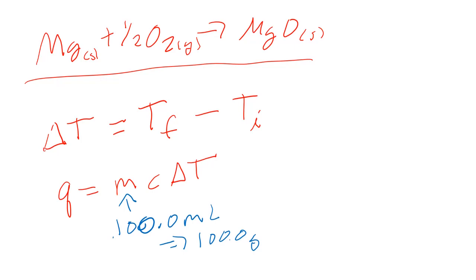C is the specific heat. Since the hydrochloric acid is diluted with water, we can just use the specific heat of water as an approximation, and it's a pretty good approximation given how much of your solution is water. The hydrochloric acid will still not feel very good on your skin if you get it on there, which is why you need to be careful with it.